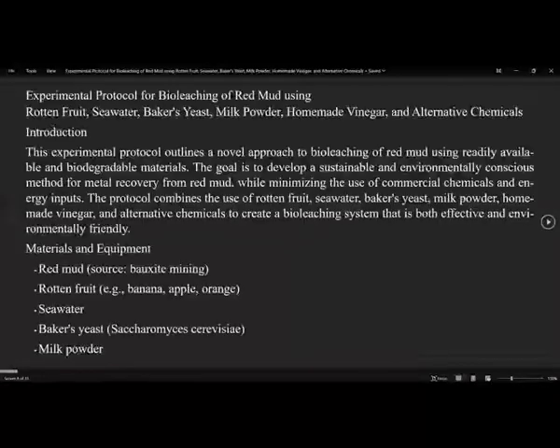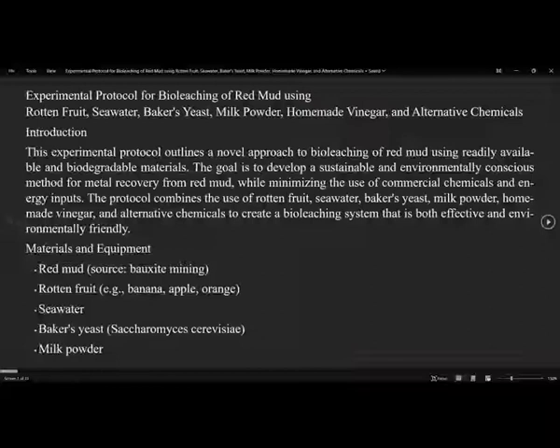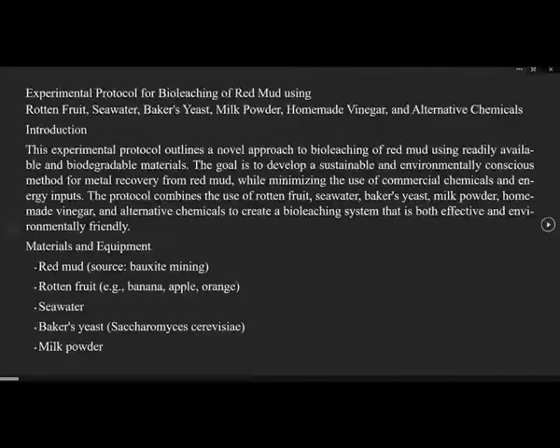Protocol for bioleaching of red mud using rotten fruit, seawater, baker's yeast, milk powder, homemade vinegar, and alternative chemicals. Introduction.